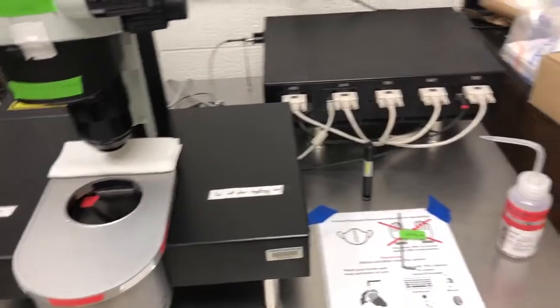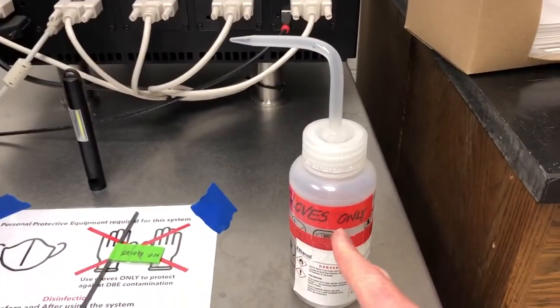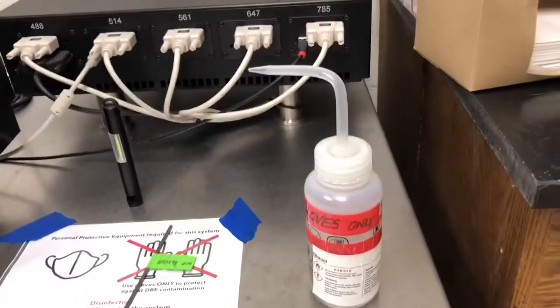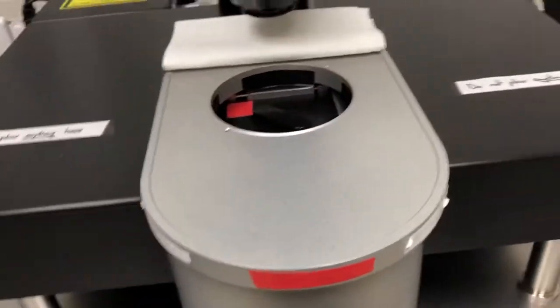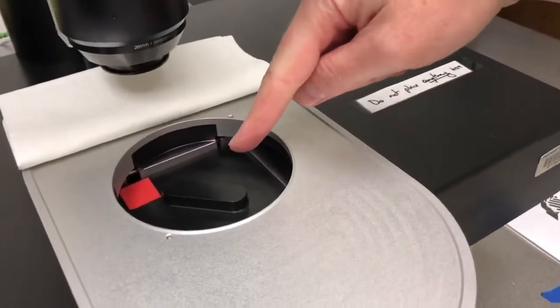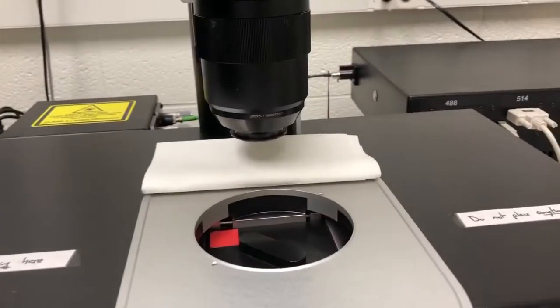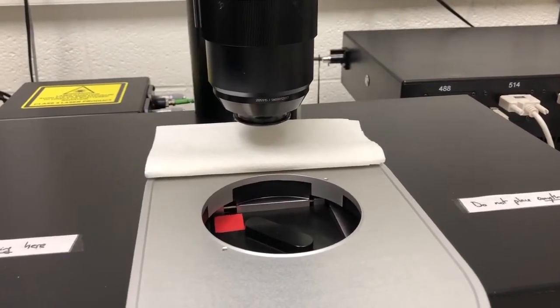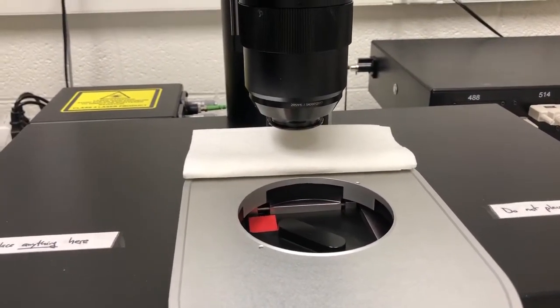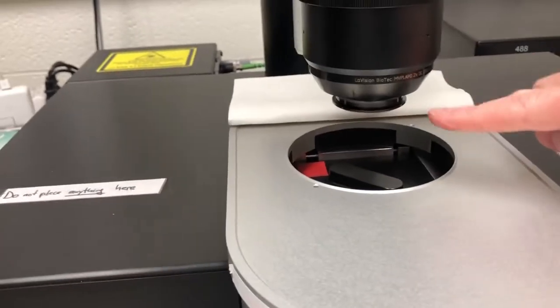The four things that you need to touch with gloves are: the bottle of ethanol that you will use to clean minor spills or to clean the objective, this plate, this lid, and the fourth thing is the only item not labeled — because it actually goes into the DBE reservoir — and that is this part of the objective.